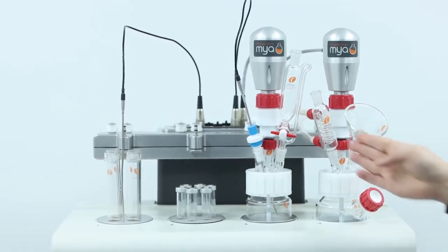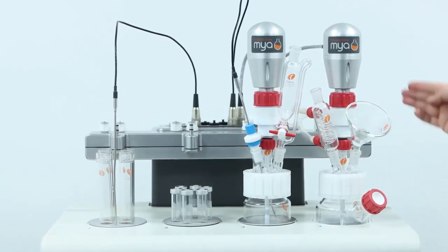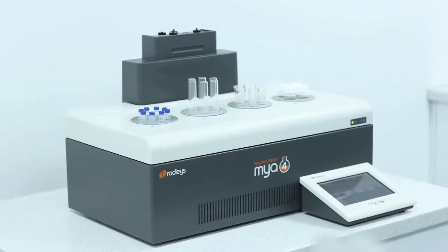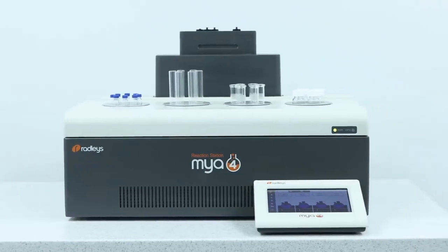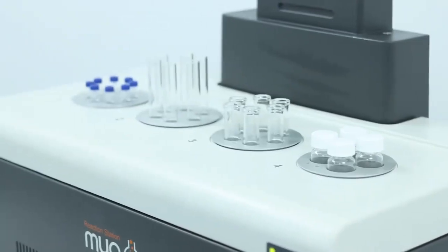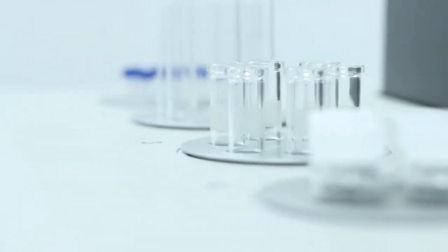The head is used to provide refluxing and inerting when using vessels and flasks. The refluxing and inerting capabilities don't apply to the multi-position tube inserts, so you could use tubes and vials with no head at all.